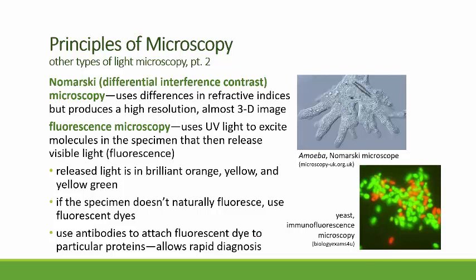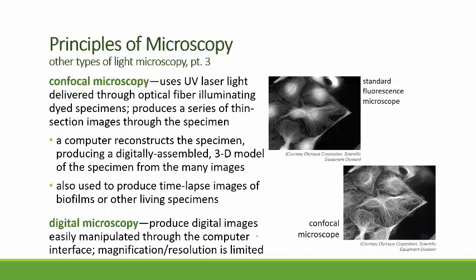So Nomarski and fluorescence microscopy, and then confocal microscopy. This time you're using laser light that is delivered through optical fibers that illuminate the dyed specimen. Then you take a series of digital images as you focus through different zones of the specimen.